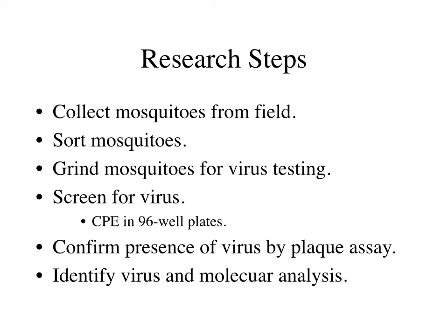So ultimately what we're going to want to do is to form pools of mosquitoes. And so here you can see we're putting a mosquito into a tube. Well, we collected hundreds of mosquitoes during this project, and you can't afford to analyze each one separately. So we put them into groups in the tubes, but we'll put only the same species in the tubes.